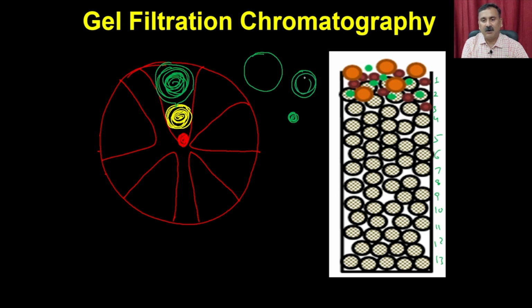Now when these three molecules are competing with each other, they should run fast, right? You know that the small size molecule is very small and also lighter in terms of the particle, so the dynamics of this molecule is going to be very fast.